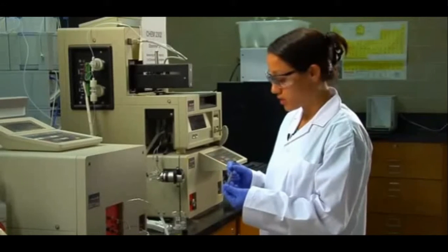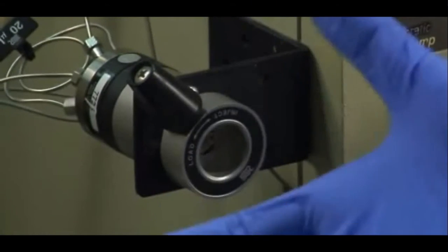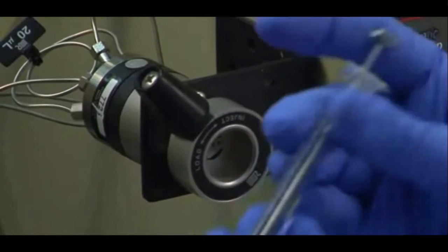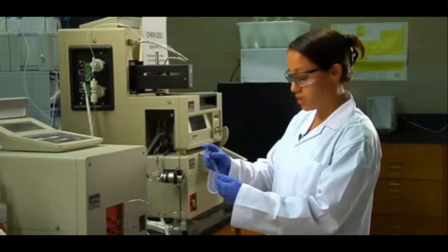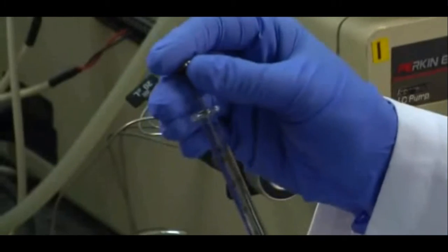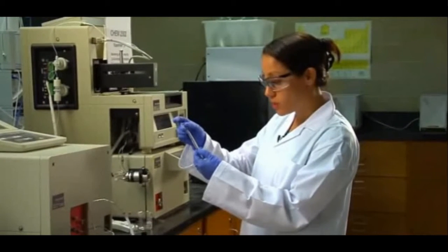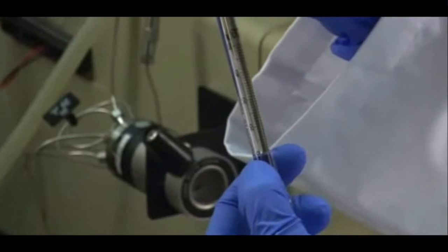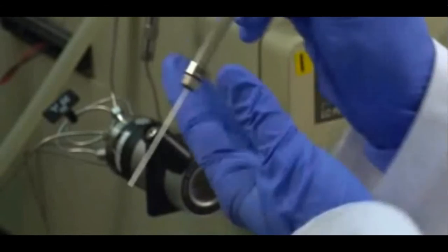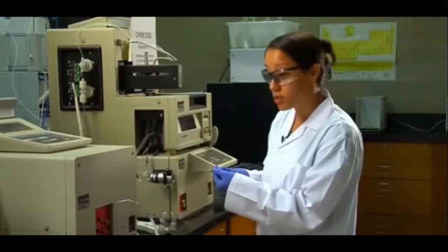One thing you want to make sure before you inject your sample is that your injection port is in the load position. There are two positions: load or inject. Load means you're going to load your standard or sample solution into your sample port. Here it's labeled 20 microlitres, so I'm going to use 50 microlitres to inject into the sample loop to ensure it is completely filled. You also want to make sure you don't inject any air bubbles, because it causes a lot of back pressure and errors in your injection.